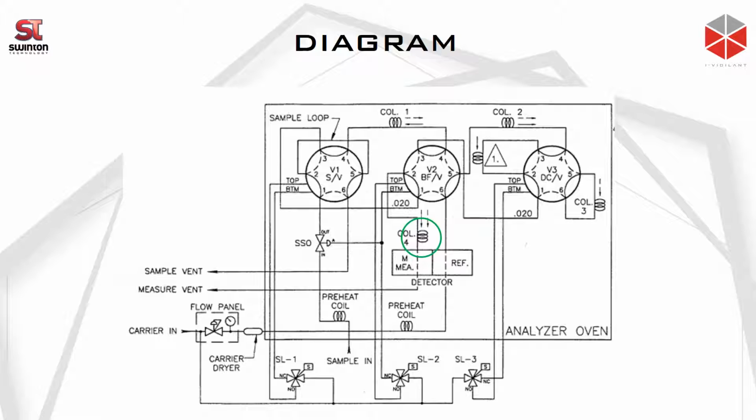If we don't put a delay on the measurement, the valve upset itself will interfere with the actual peak of the heavy end. So in order for us not to have the interference, we put a delay on it, so therefore we'll be able to see a full peak without interference through the measurement detector.